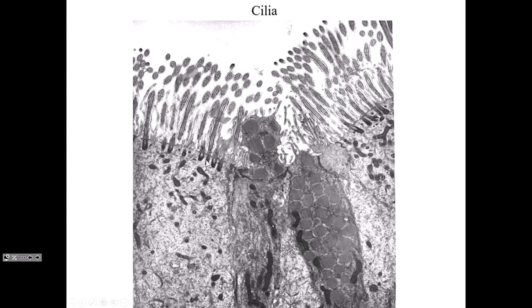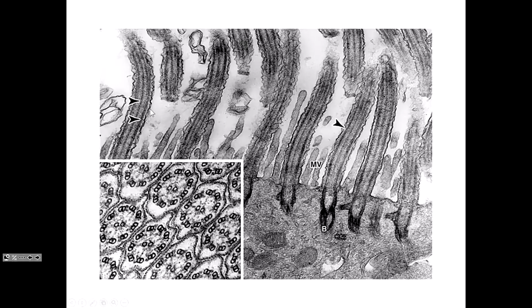And these axonemes are also embedded into a basal body, which is a centriole. And the basal body nucleates the axoneme of the cilia. If we look at a higher power view now, here's our cilia containing the axoneme. In cross-section, this is an axoneme. Here's a longitudinal section of an axoneme, compared with the microvilli.